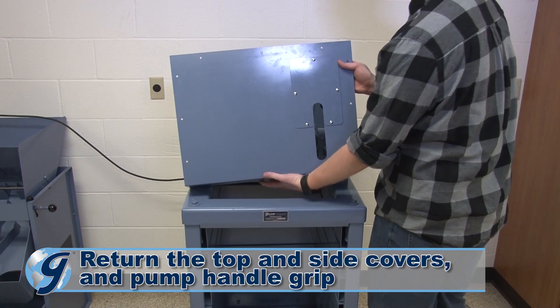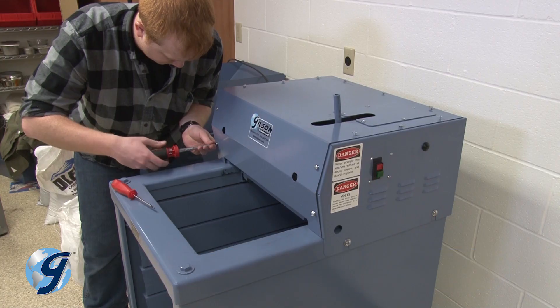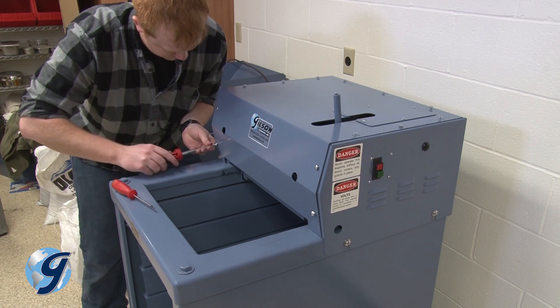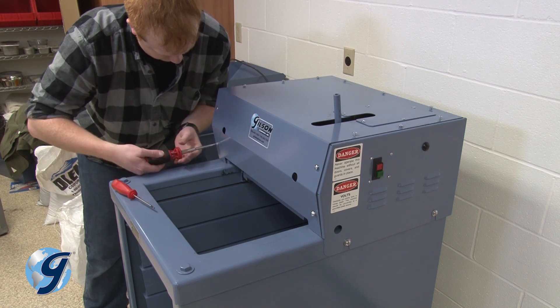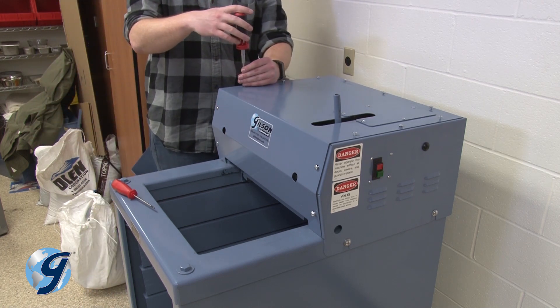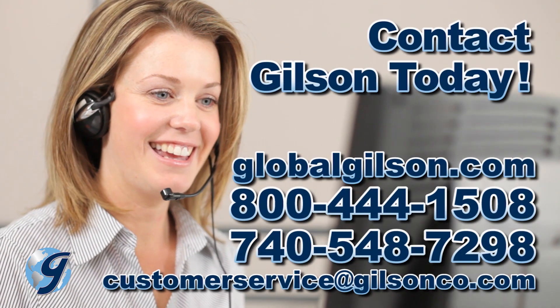Now, return the top and side covers and the pump handle grip. After fully reassembling the unit with covers installed, run the unit empty for a few minutes. The testing screen should run freely and quietly. For any questions on the hydraulic system of your testing screen or for any Gilson product, please contact your Gilson technical support team.